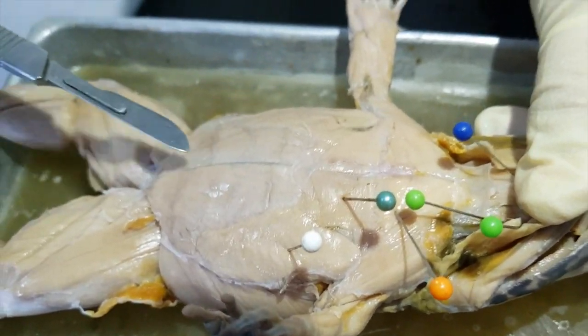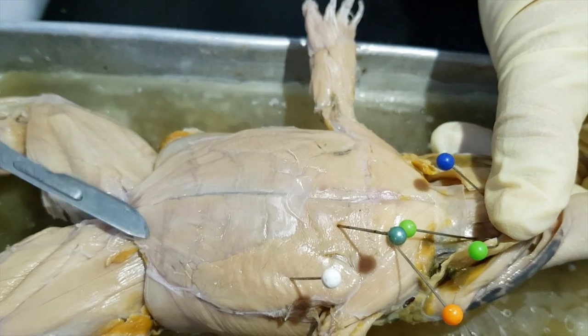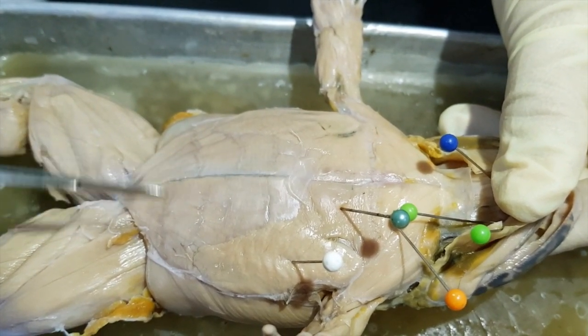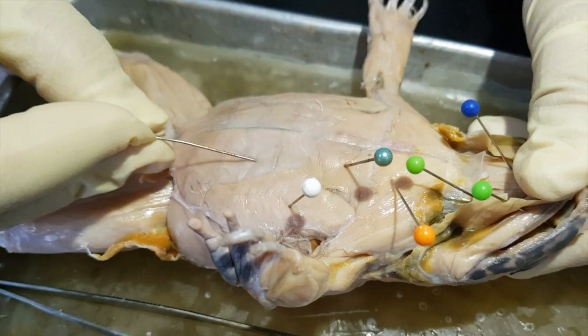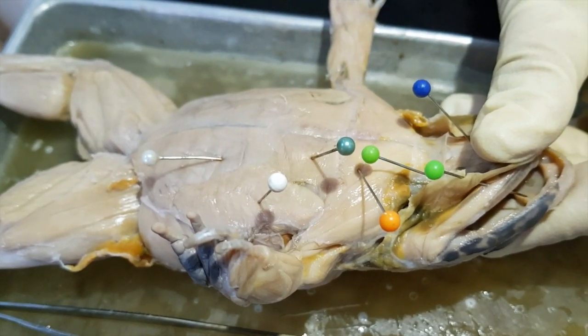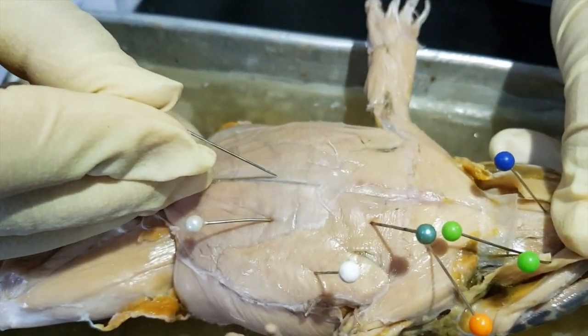This muscle here on the abdomen is the rectus abdominis. Okay, so it's separated in the middle by the linea alba. So this is the rectus abdominis and the linea alba. Linea alba is the middle part.